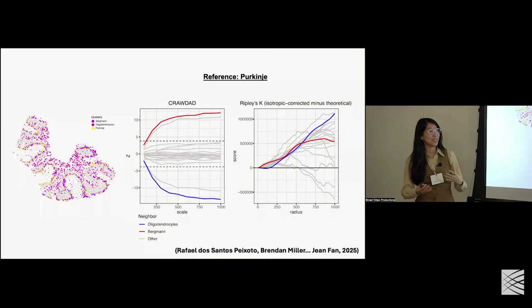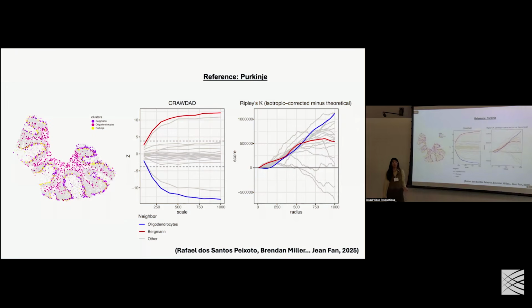I don't doubt what it's calculating. I doubt whether that null distribution is appropriate in the context that we're evaluating here, where we actually care about where the cells are in the tissue, and there's a limited number of places the cells can be, and we don't assume that this is just a stochastic point process where cells can be anywhere. So again, I don't think the Ripley's underlying null distribution and assumptions are appropriate here.